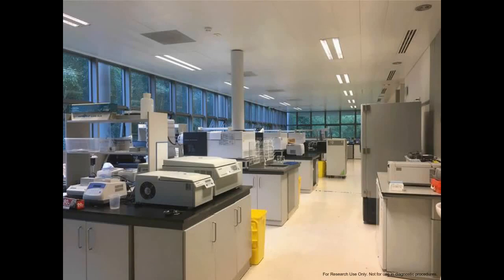And you can see that this is just a standard mass spectrometry laboratory in which we have a number of triple quad mass spectrometers. There's two in this picture, and there are now, as of Monday last week, three triple quad mass spectrometers to be able to continue the development of that workflow.